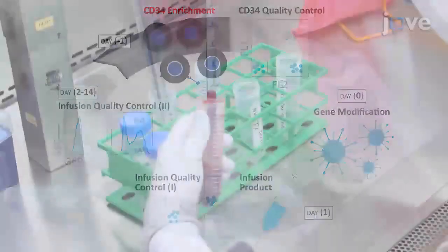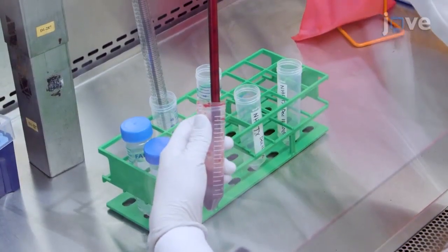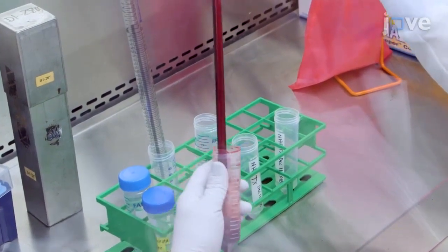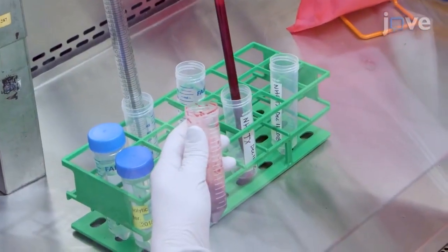Begin by adding 10 to 12 milliliter aliquots of bone marrow isolated from a healthy non-human primate donor into 50 milliliter conical tubes.